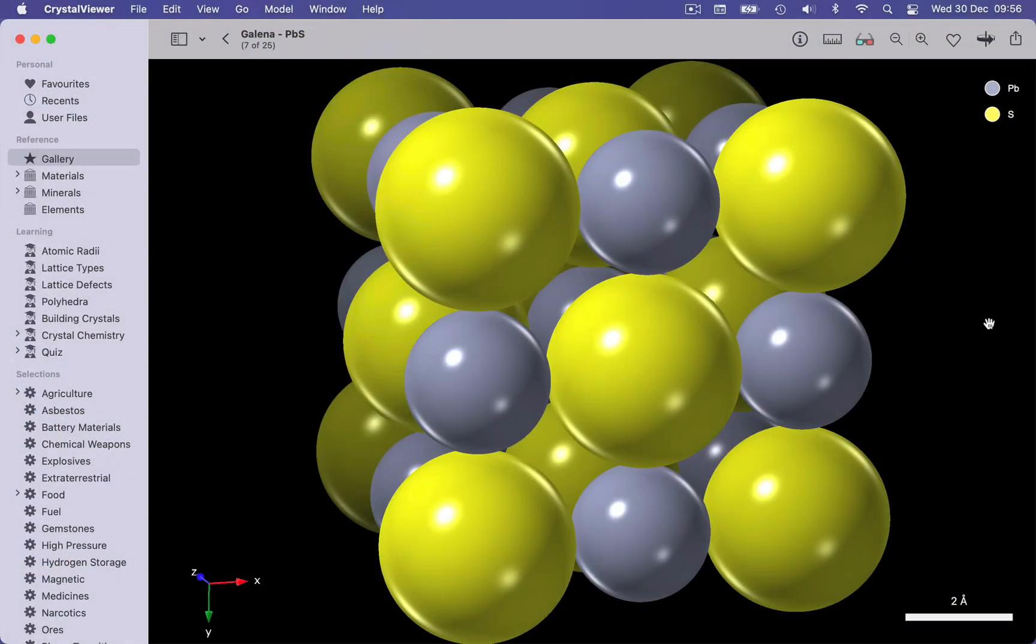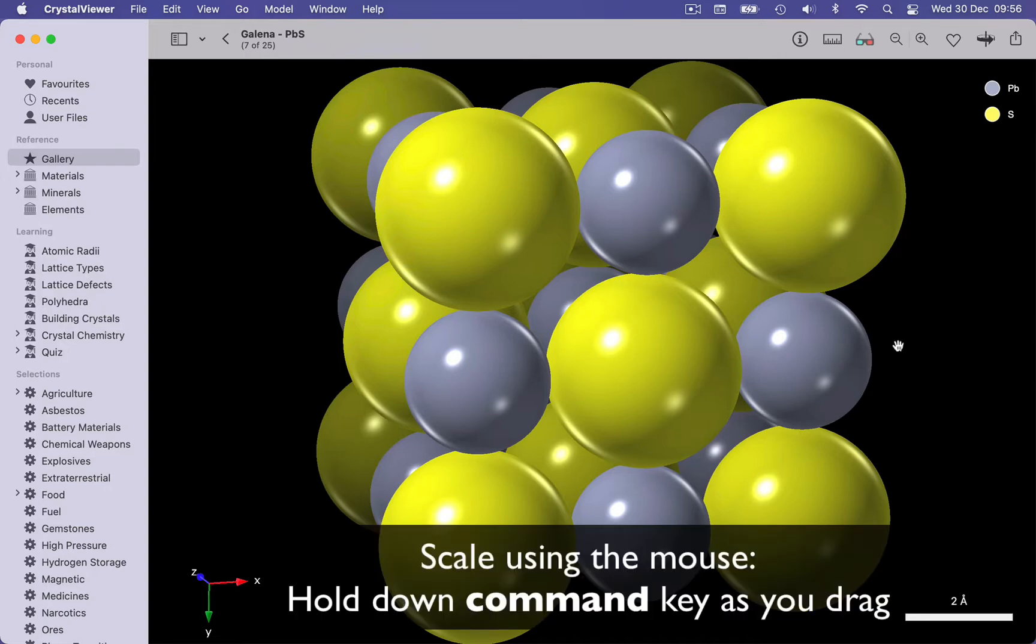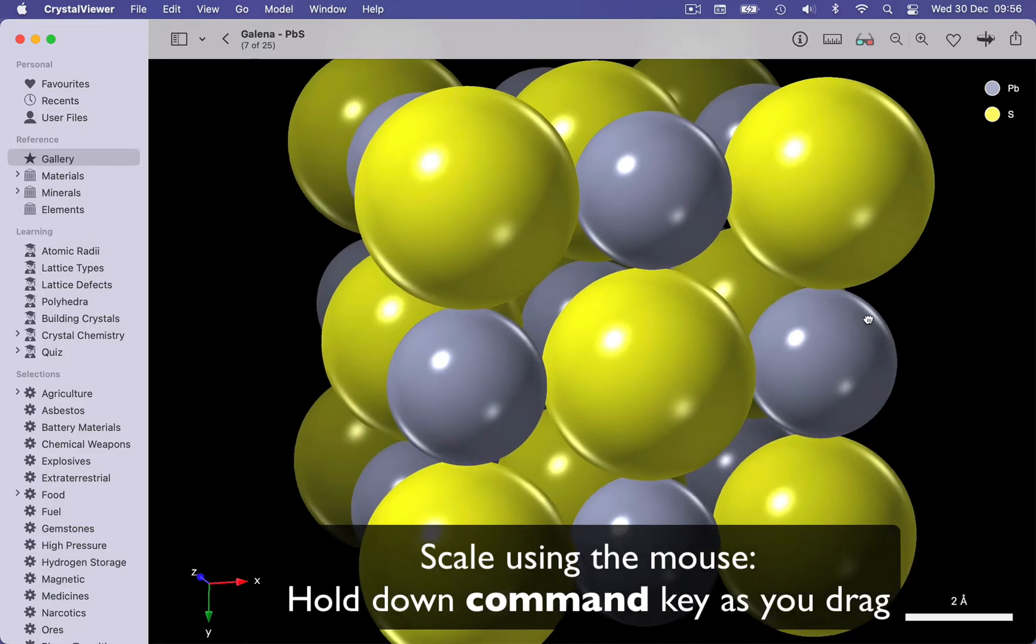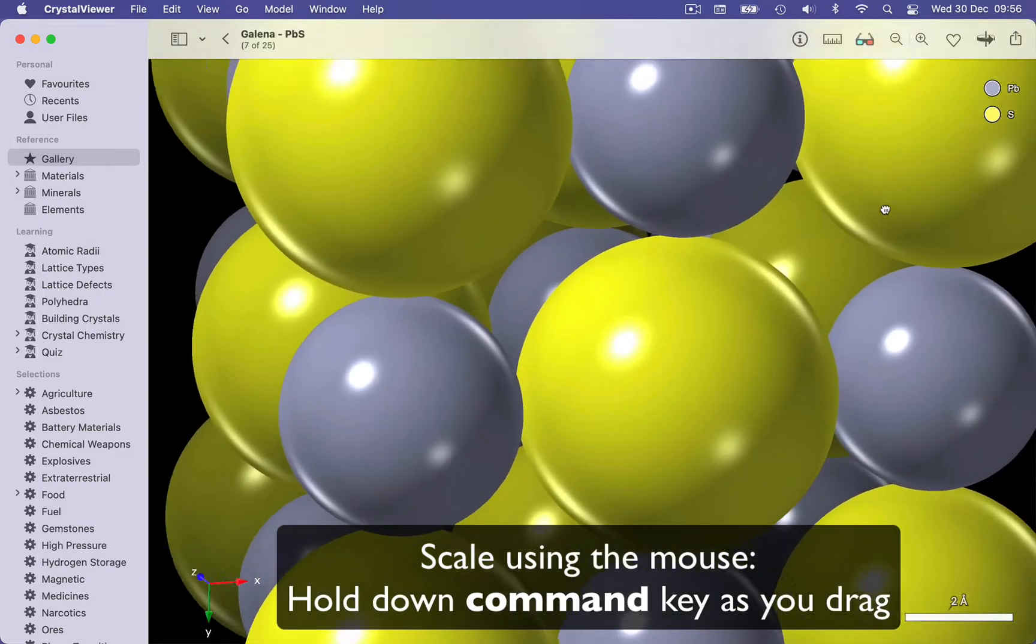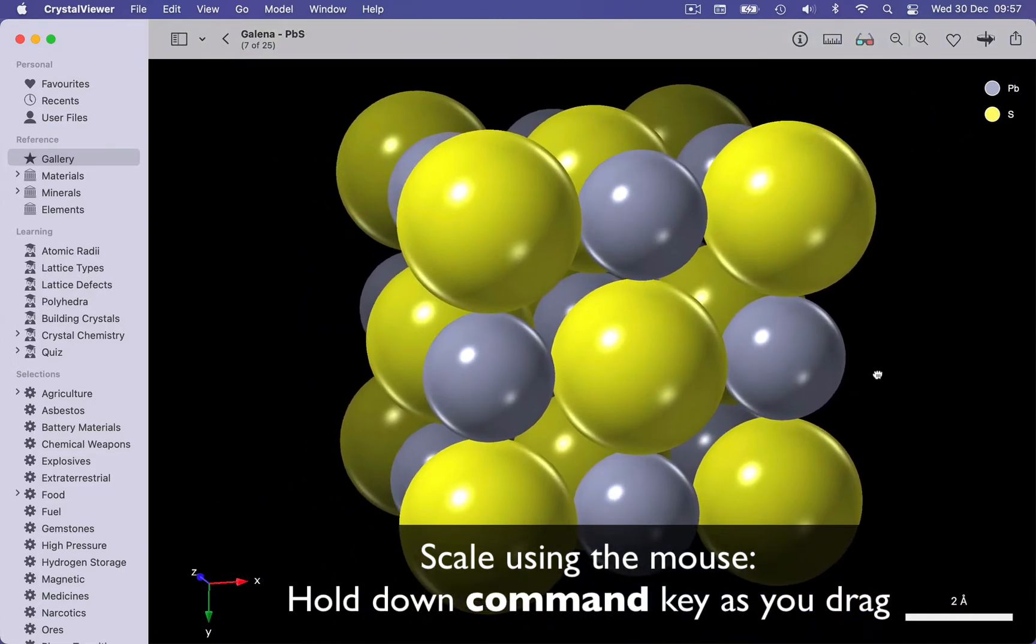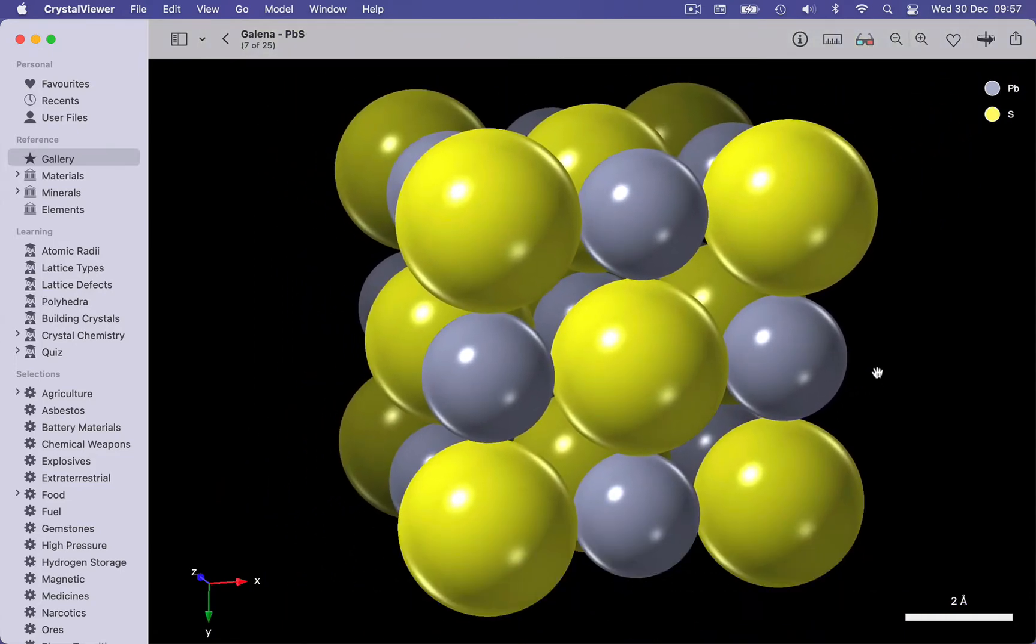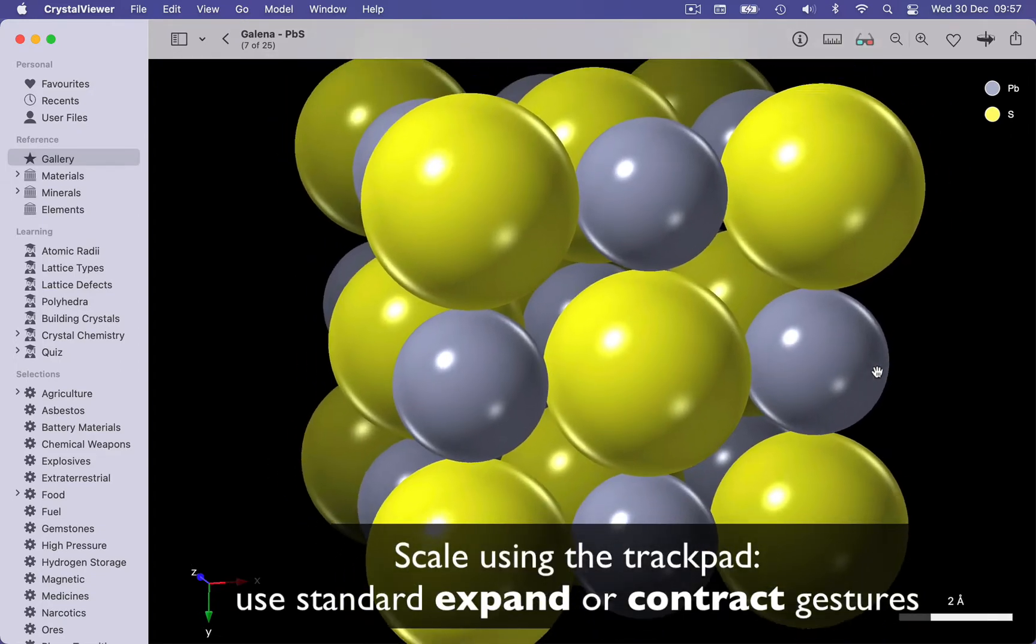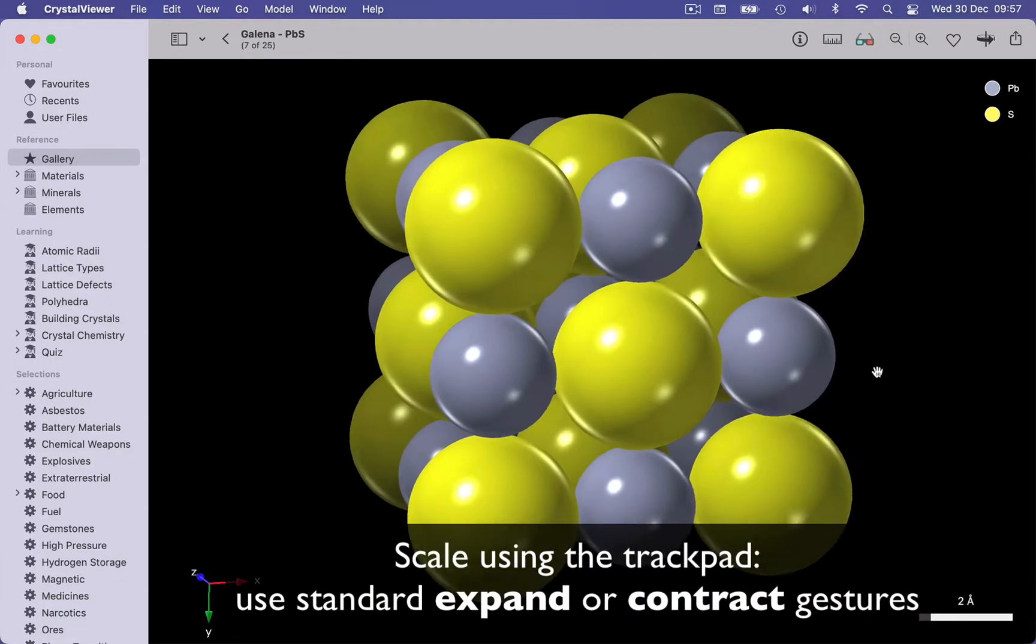Now let's talk about scaling. When you open a structure in Crystal Viewer, it is auto-scaled to fit the available space. But we can override this. We can scale using the mouse, and to do this we need to hold down the Command key or the Windows equivalent of the Command key, and then we can click and drag up to make it bigger, or down to make the model smaller. Perhaps it's more intuitive to use a trackpad. And then we can use a simple expand or contract gesture to change the scale.